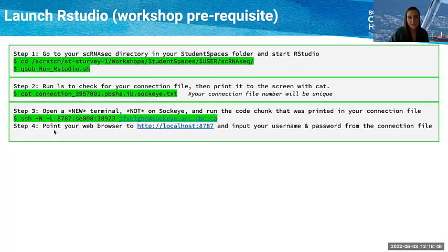After that, you're going to open a brand new terminal or whatever you're using for this, and you're going to put in this, but yours will be different and unique to what it says up here in this connection file. So follow the steps there. Copy the part that looks like this, but tailored to you, with SSH into a new terminal, and then follow those prompts.